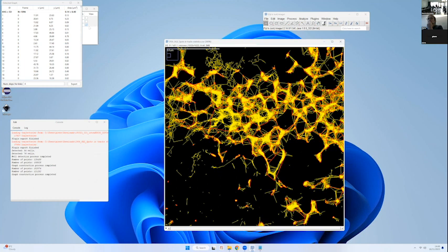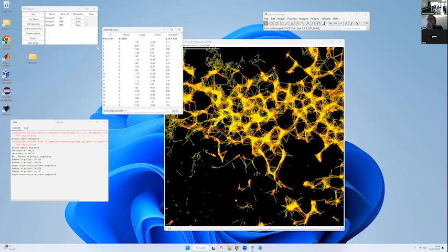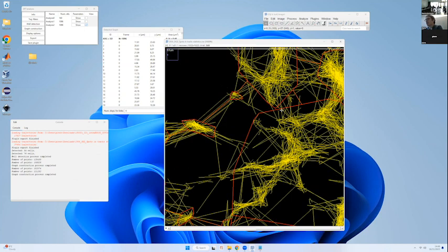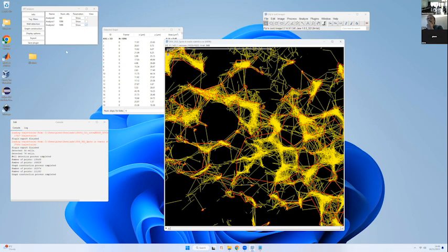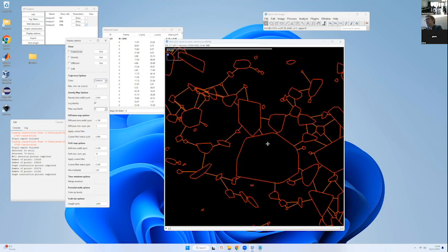Personne n'avait pas mis 0,2, et il y a un truc comme ça moche qui apparaît. Il n'a pas bien détecté. Okay. So, pareil, là, ah non, maintenant c'est bon.